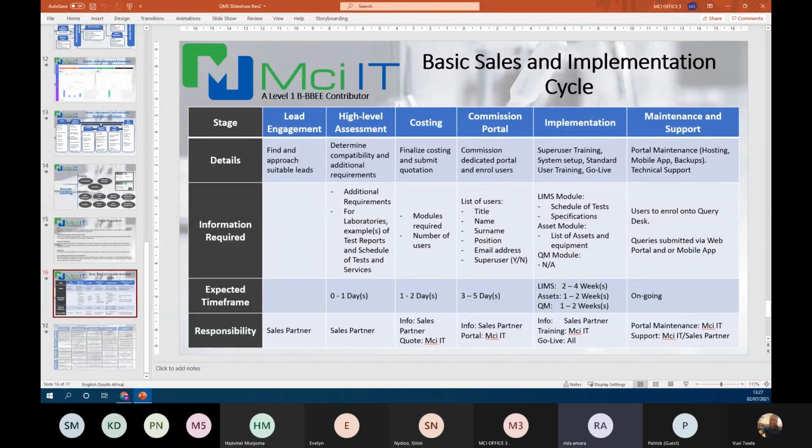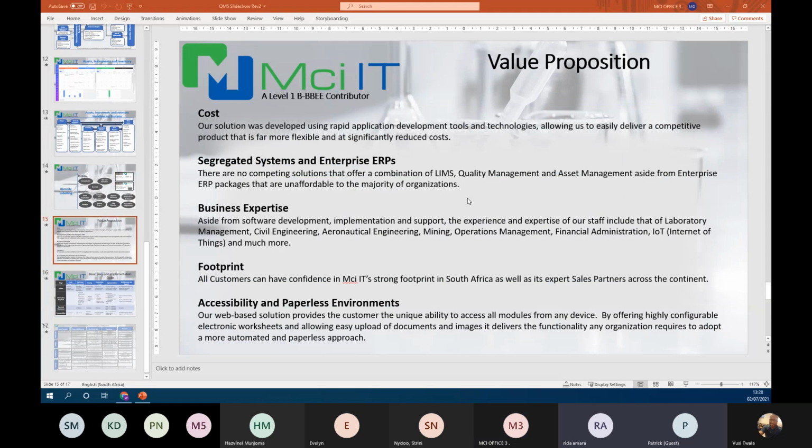So this is Rida from Morocco. I have maybe a question. I wanted to know what the system offers compared to the competitors, if there are some competitors existing. So, for example, I want to sell the system to a laboratory. What are the arguments that I can use to support my system and say that this system offers these features compared to the competitors? Is there any specific or precise information that I can use in this sense?